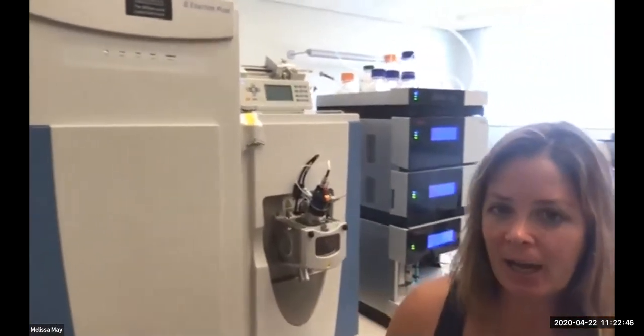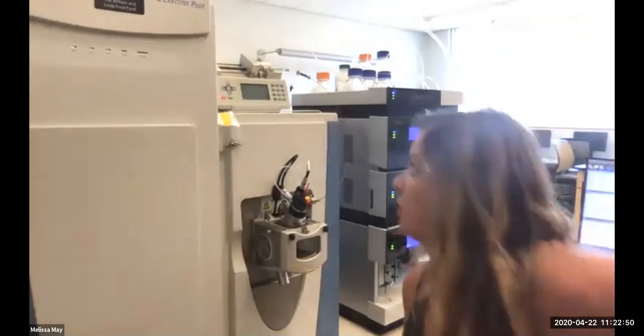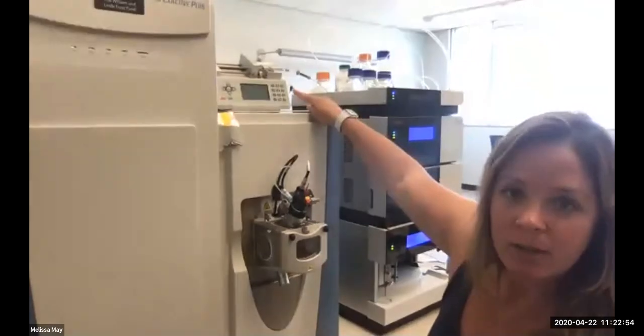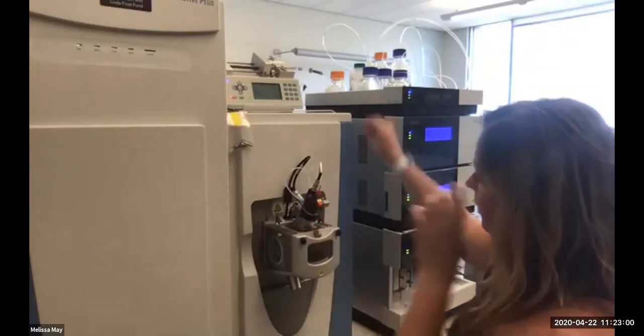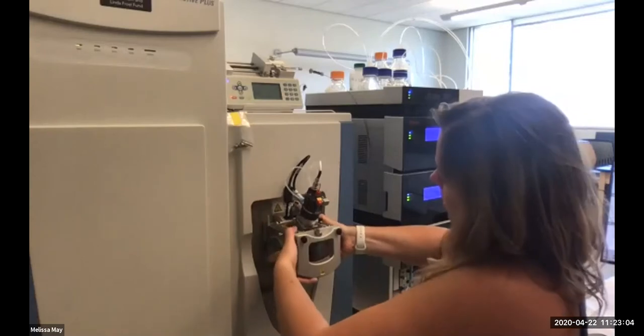For the mass spec right now, we have the HESI, the heated electrospray ionization source, hooked up to it. And then you can see up here, we have our syringe pump. If I were to take these apart, I can show you a little bit.